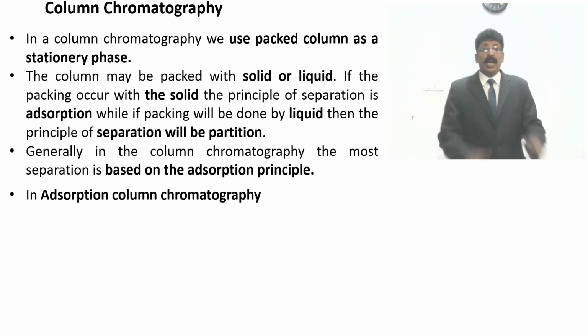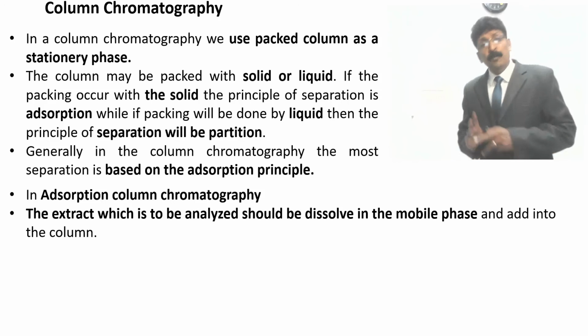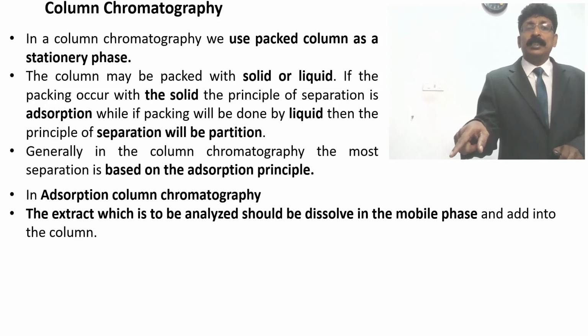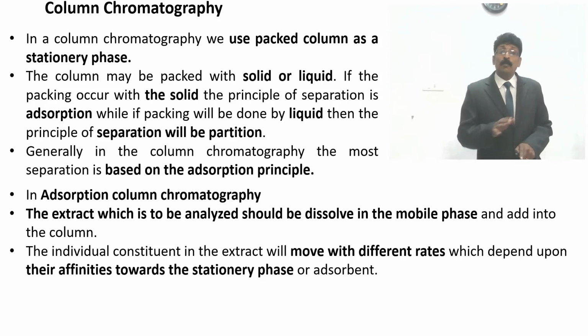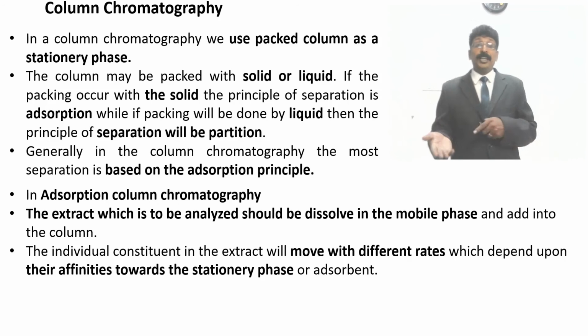In adsorption chromatography, the extract to be analyzed should be dissolved in the mobile phase you are using, which makes it easy to add to the column. The individual constituents in the extract will move with different rates depending upon their affinity towards the stationary phase.